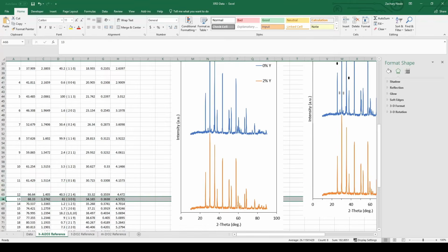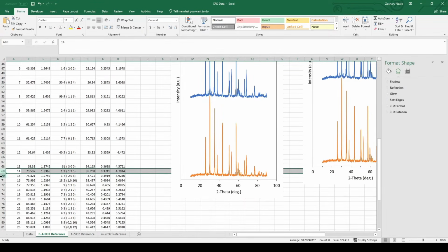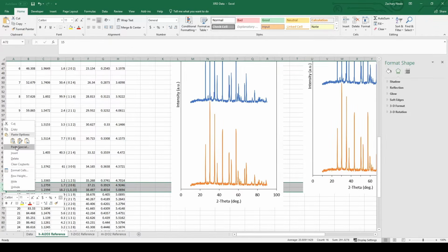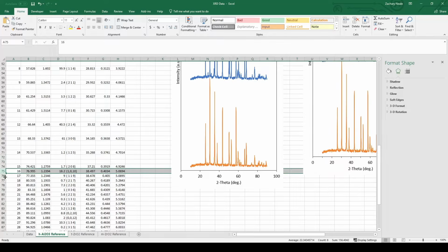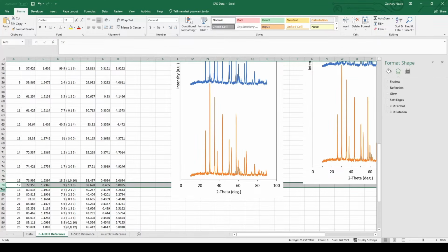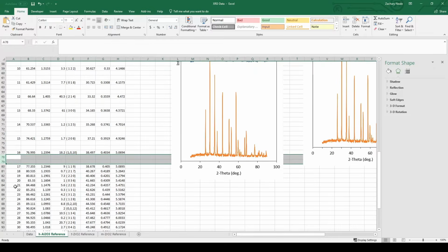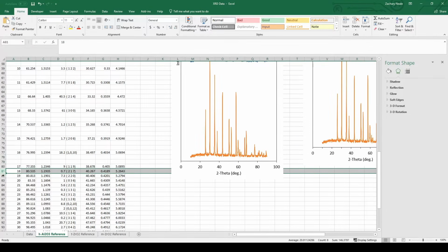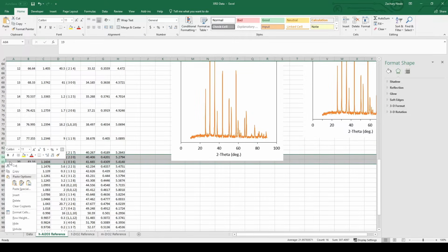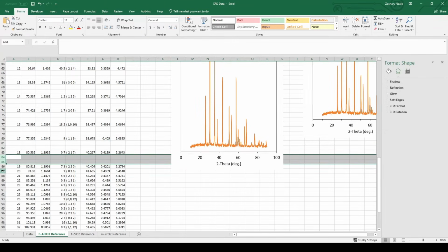And if you guys know an easier way of doing this, please let me know. I know you would be able to make a macro program with Excel to do this automatically, but I think the time I would take to invest in learning how to do that probably outweighs the time it takes for me right now just to do this.